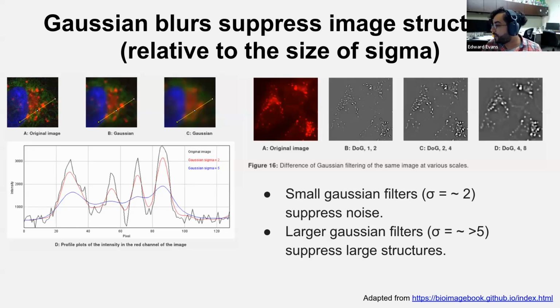So what's happening here? This is a little snippet I got from Peter's blog. So like I said, go check it out. It's fantastic. And what we're doing here is a very easy way to do, well, let me put it this way. What we're doing is taking the input image here, and when you apply a Gaussian, you are suppressing noise. And depending on how large that Gaussian is, you get more or less suppression.